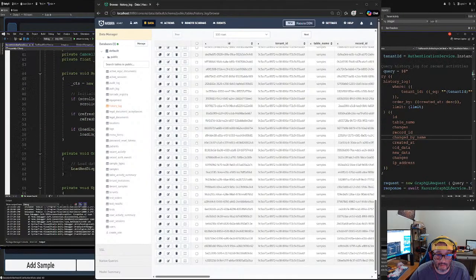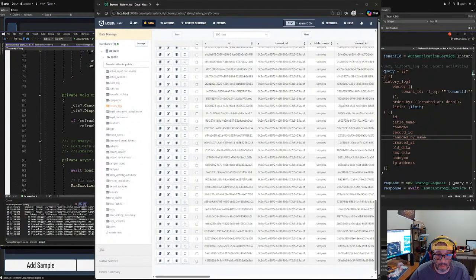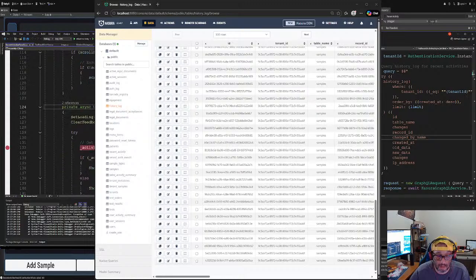So then we have in destroy, load data here. And then activities, we go here. No activities, no activities.